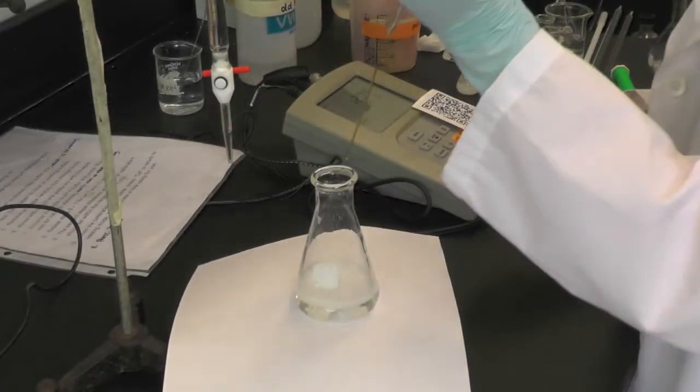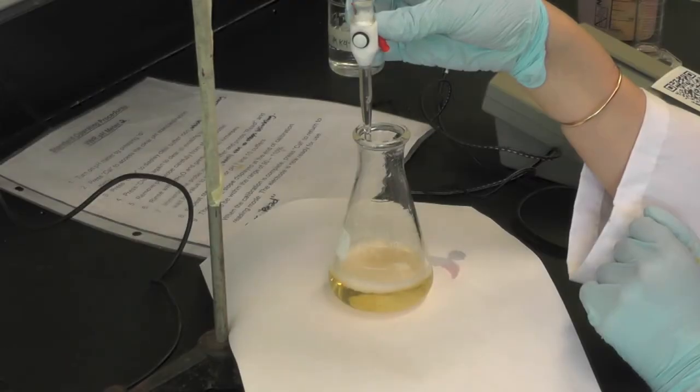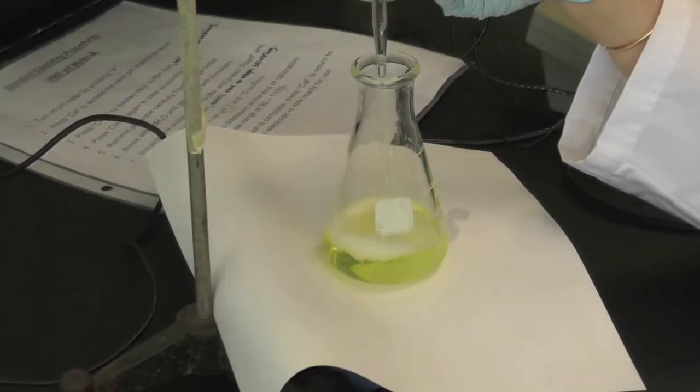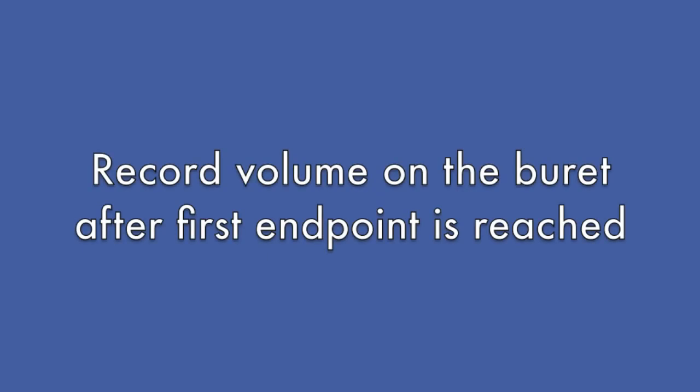Next, add 1 drop of the calcium indicator, then you can begin to titrate with the calcium chloride standard solution. Remember to record the initial volume on the burette every time you start a new titration. Once the solution reaches a definite and permanent bright green color, the first endpoint is reached. Record the volume on the burette.